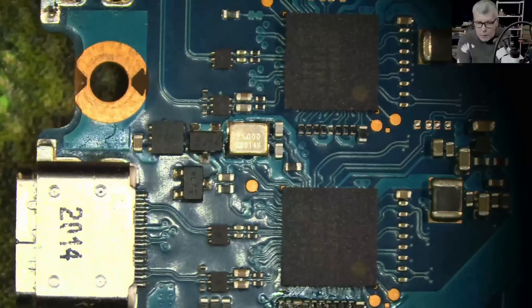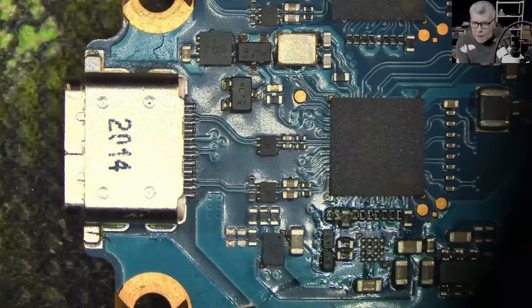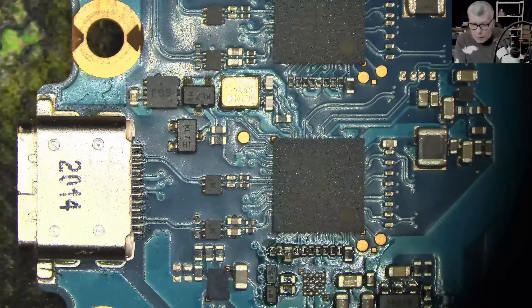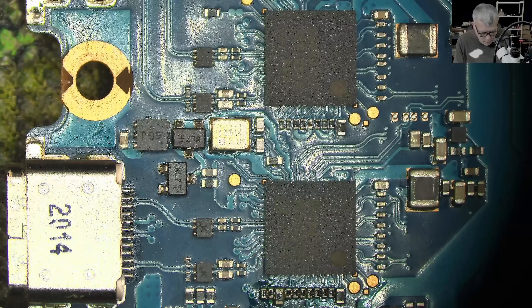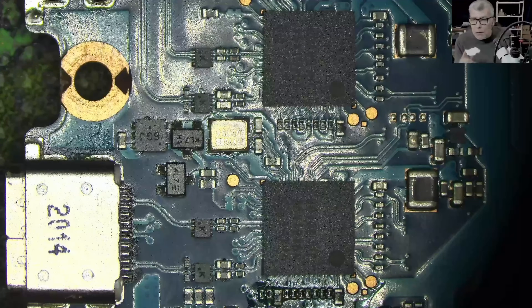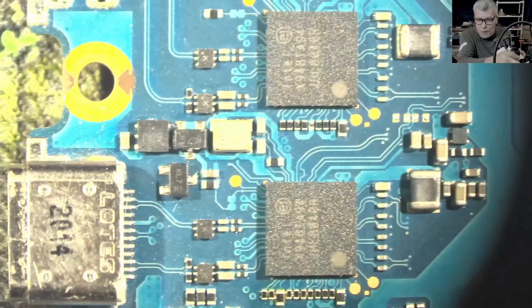Let me make sure about the polarization filter — with it on I can even see the writing on the chip. I'll remove the polarization filter for the test and take some screenshots to compare with the other camera. Here is proper focus — screenshot captured. Next, low light: this is with only the polarization filter light on, taking a screenshot. Then no light at all — I still have a picture, which is crazy. Screenshots captured for all three conditions.